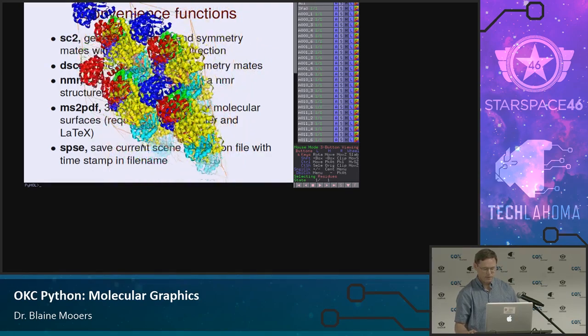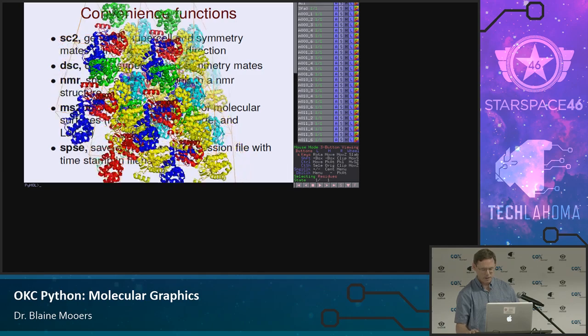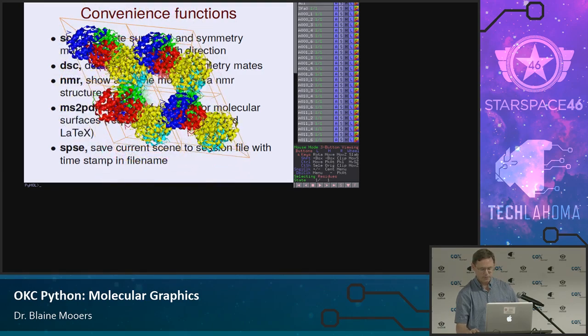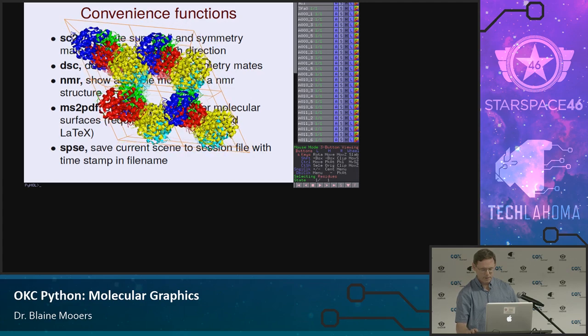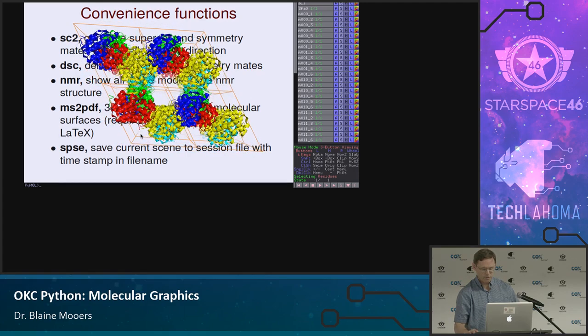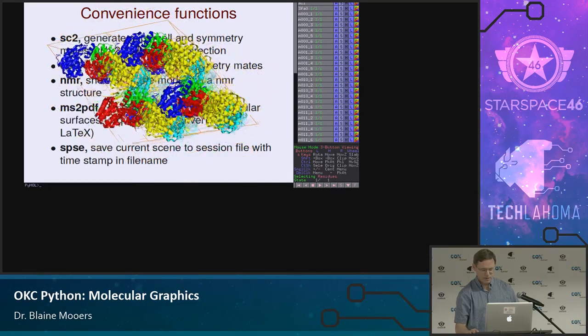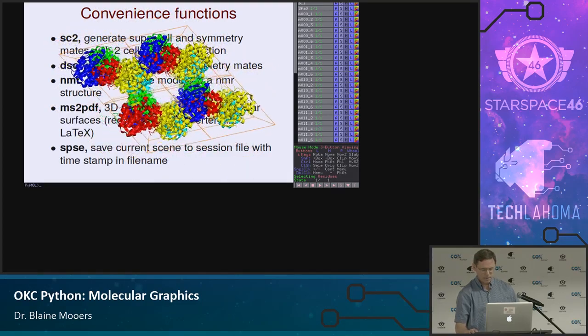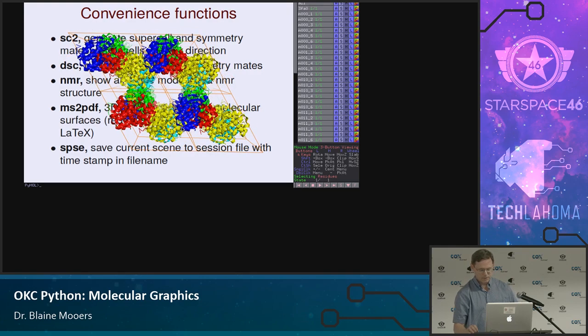representation. So these boxes are the basic unit cell of a protein crystal, and there's a total of eight boxes that build up the crystal by translation. And we're looking down the unique axis, one particular axis that builds up this crystal.